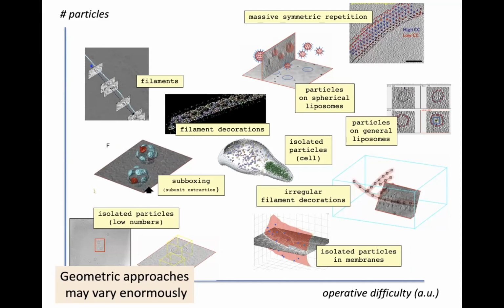Nowadays, there are a lot of advances in this direction towards an automated segmentation of tomograms, but we are still not there. So that still these days, I would say that each new tomography project is very much a new story for new practitioners.